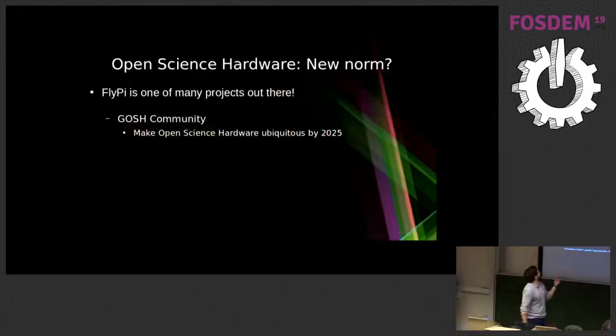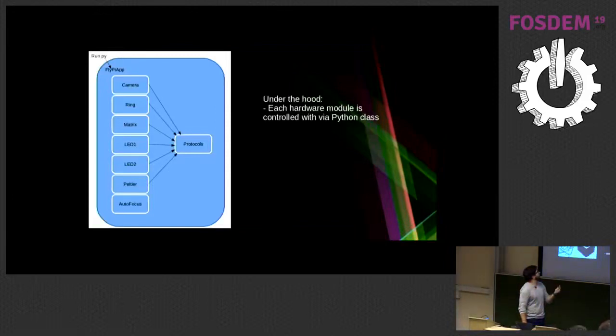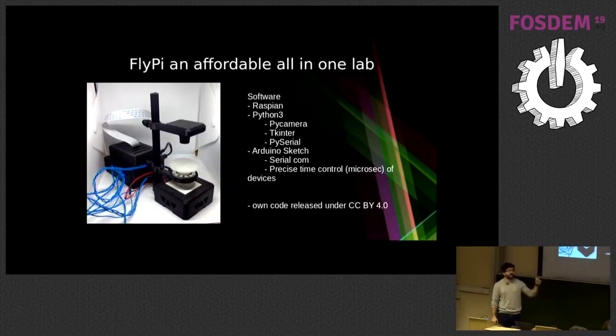Sorry, yeah, of course. This is the Pi camera, really the first version. And the only difference, how could I forget that? That's absurd. So you can see it here, right? This has a little lens that comes from surveillance cameras. It's an M12 thread that you can get anywhere, and we just adapt this in front of the Pi camera. Then by changing how far this lens is from the sensor of the camera, you can get a higher or smaller magnification. You can find a version of the camera on KitSpace.